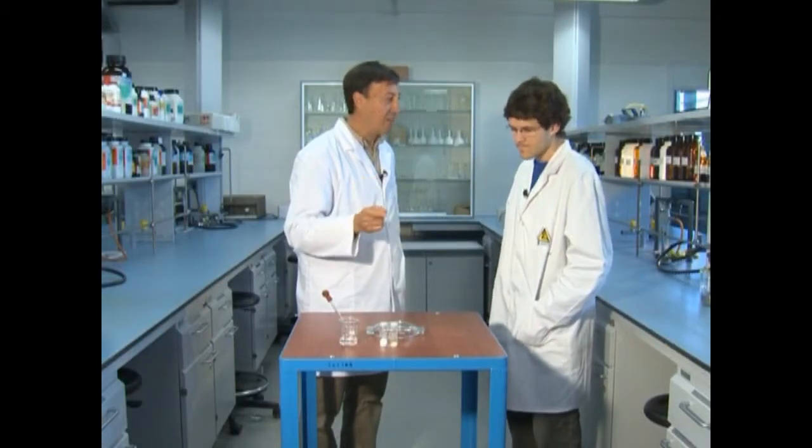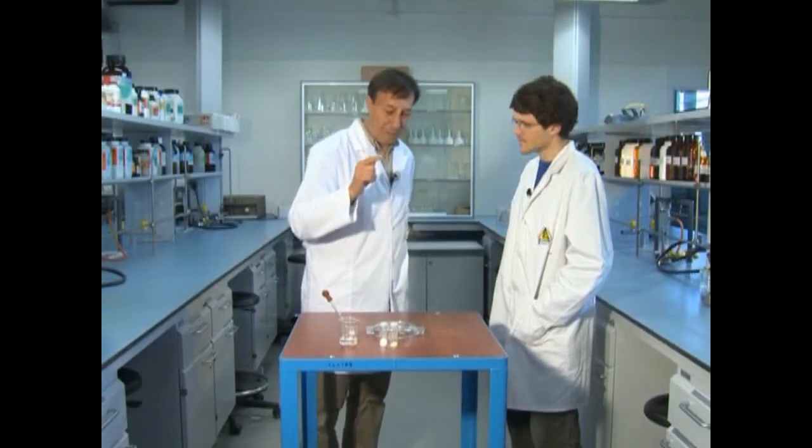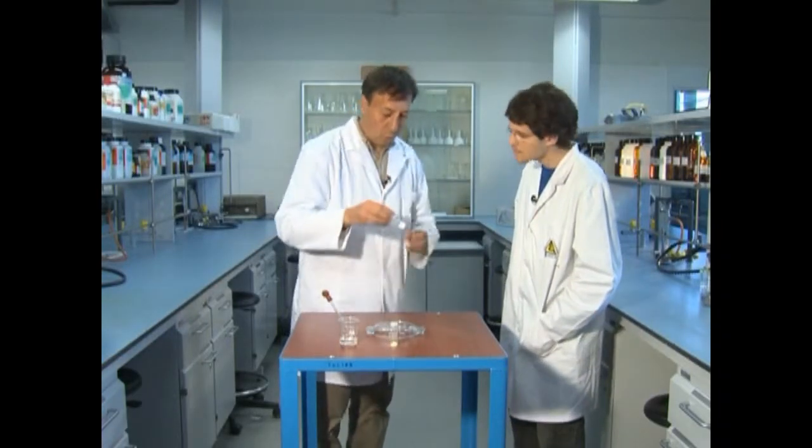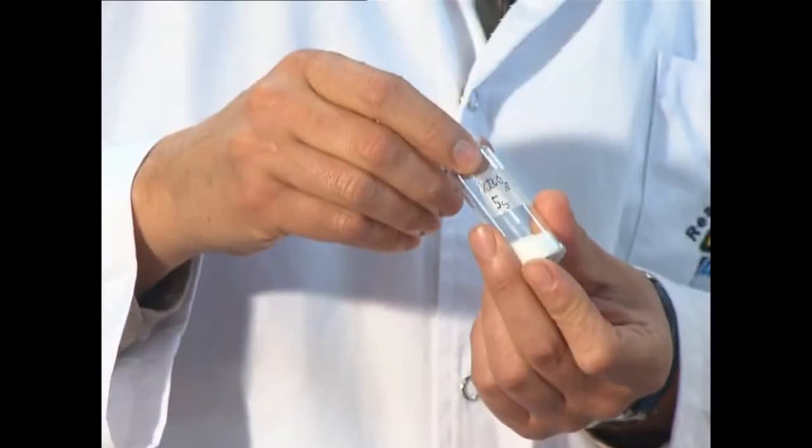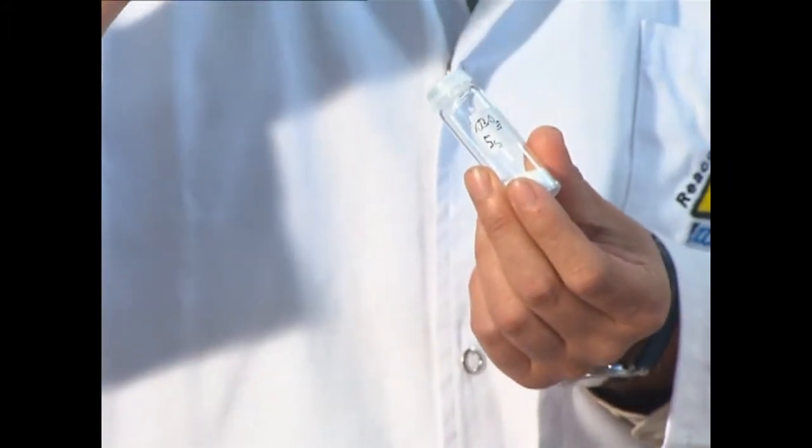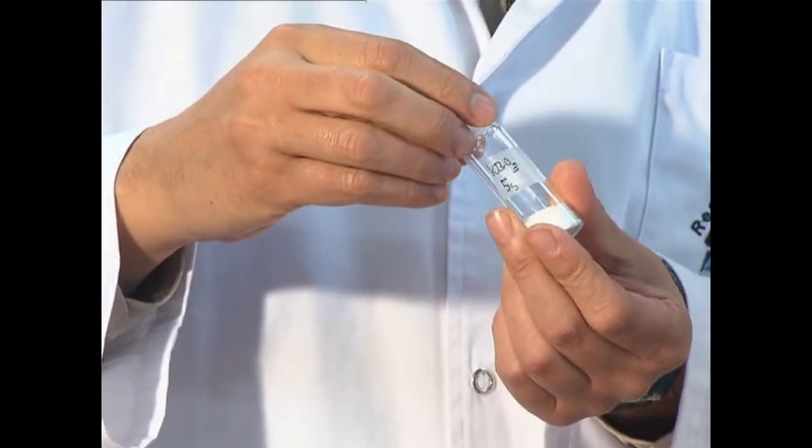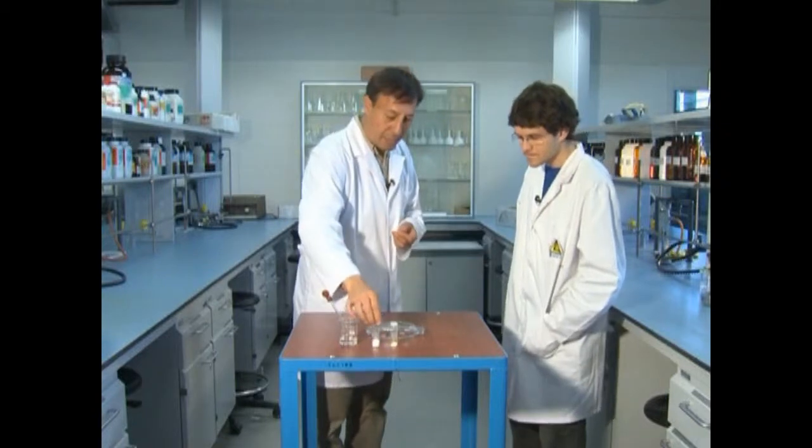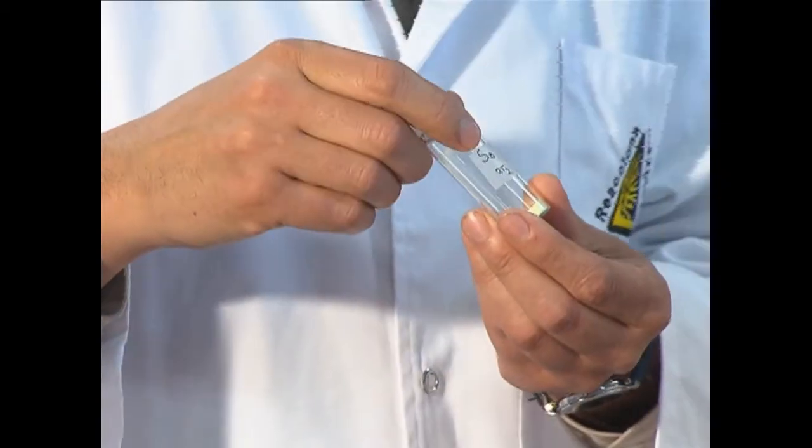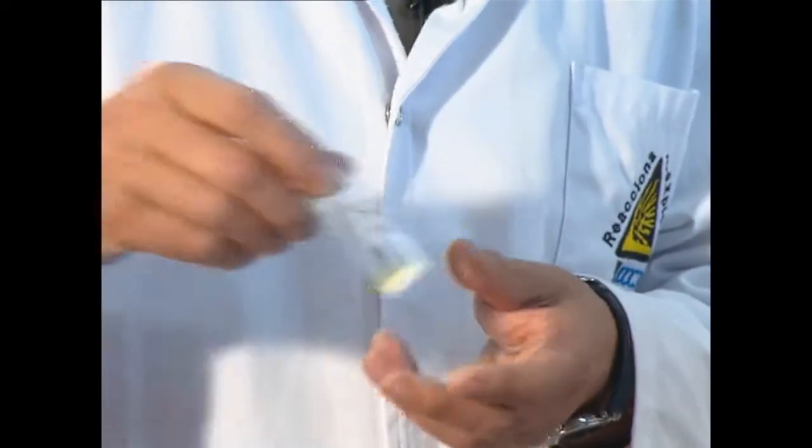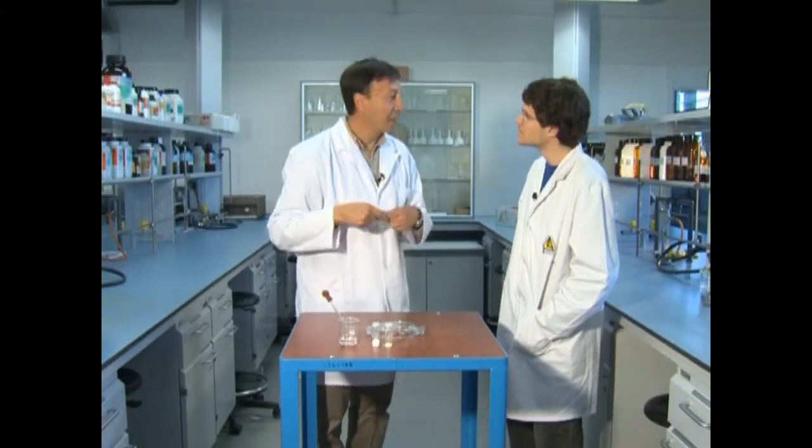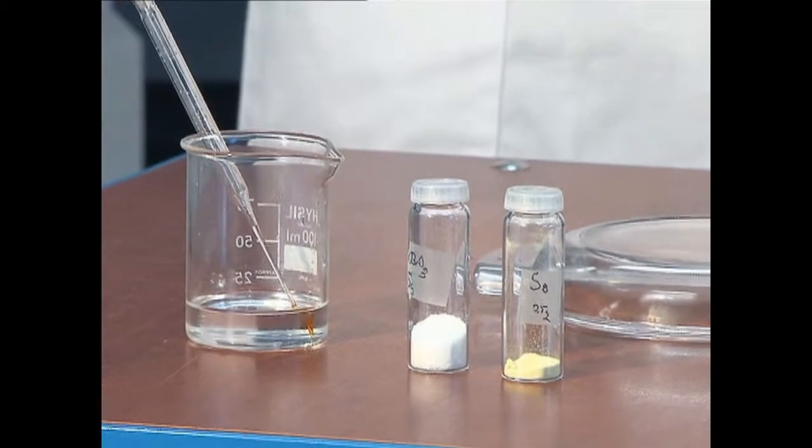I ja veuràs aquí la pudor que farà l'experiment, en el qual barrejarem un compost que conté brom, però amb un estat d'oxidació molt gran. Es tracta del bromat de potassi. I el barrejarem amb un reductor, que és el sofre. El sofre i el bromat els farem reaccionar per donar brom.